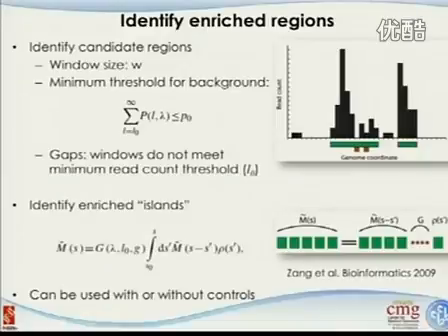And the next step is they will combine the signals of different bins together, using a much more complicated statistical model, and try to see: if I see this many consecutive bins that have signal with a few gaps in the middle, what is the genome-wide probability that this is a background or not?